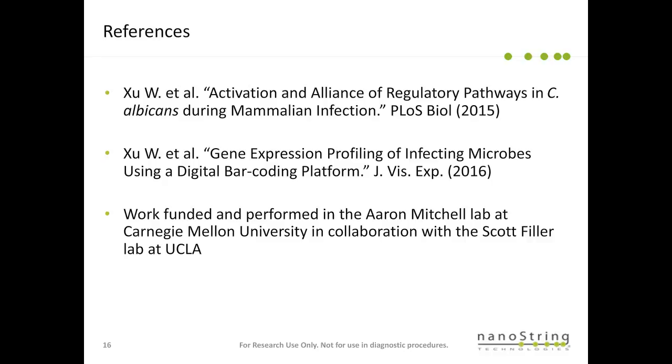This paper not only contains a very detailed protocol of how to perform the RNA isolation as well as the NanoString nCounter assay for infectious disease and pathogen-specific studies, it actually includes a video of me doing the experiments.